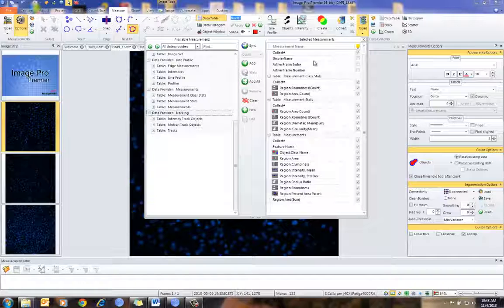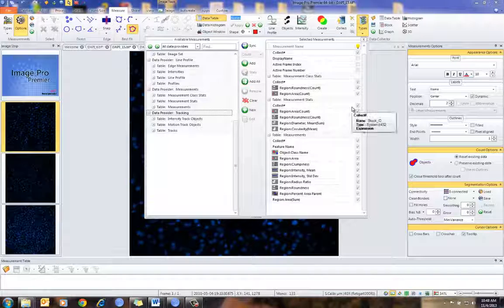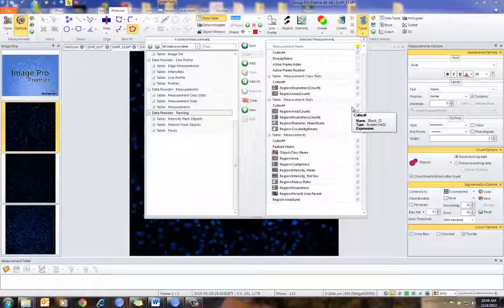Here's an example showing some information that you can collect. What we're going to do is set up Data Collector and use a shortcut method on how to accumulate data that has been set up in Count Size.